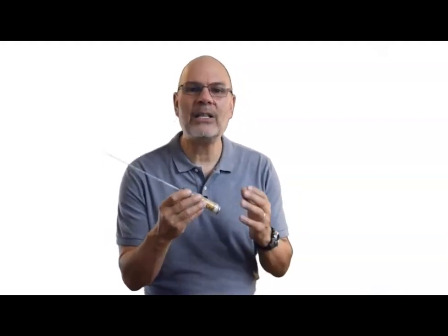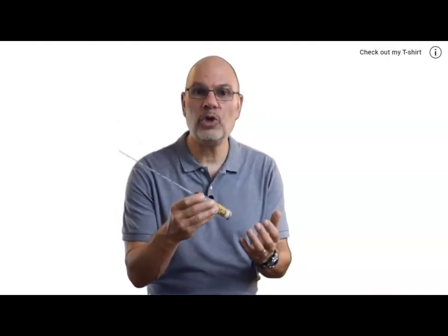So now that you know how a respirometer works, you can do all kinds of inquiry. Think about different variables like different types of seeds, or how long it's been since they germinated, or using different kinds of organisms altogether. In every case, you're going to think about how to test those variables, and you're going to have to design an experiment with adequate control.